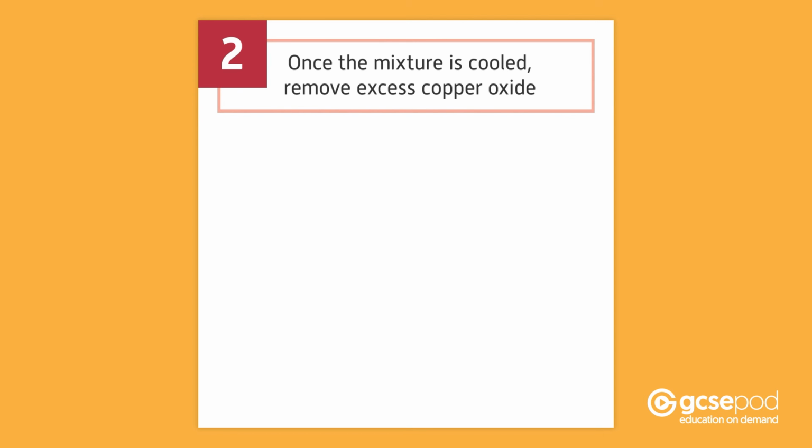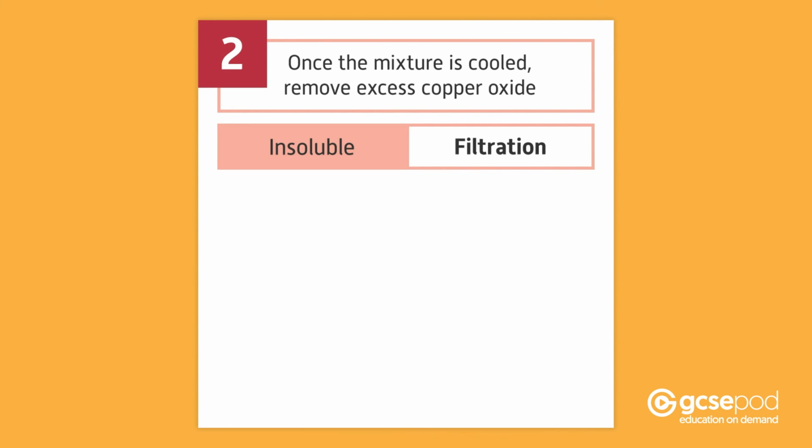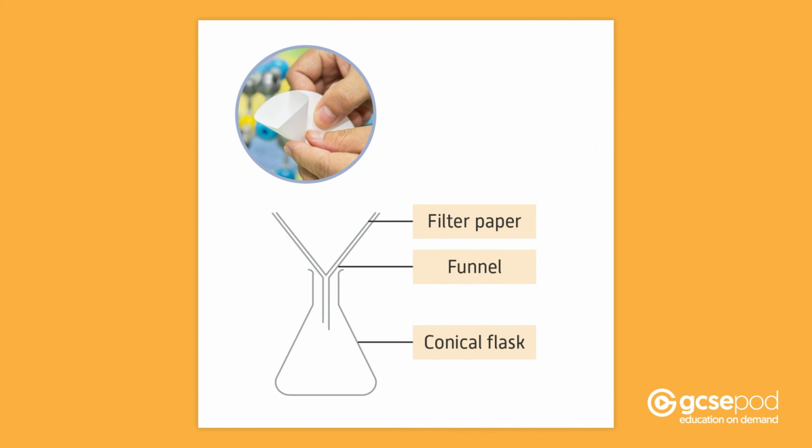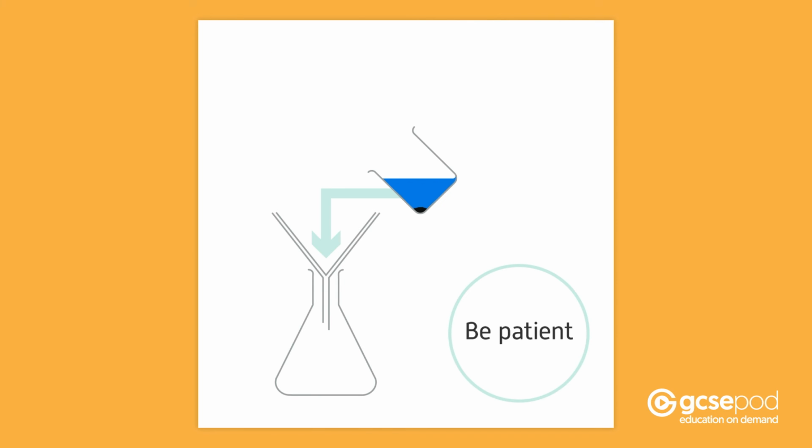Step 2. Once the mixture is cooled, you need to remove the excess copper oxide. Because it is insoluble, filtration is used. Place a cone of filter paper into a funnel and place this into a conical flask. Make sure that you fold the filter paper correctly to ensure that no copper oxide seeps through into the flask. Also, be patient when pouring the mixture through.